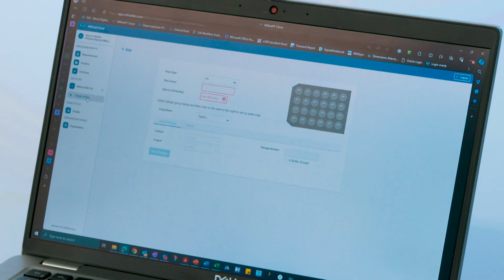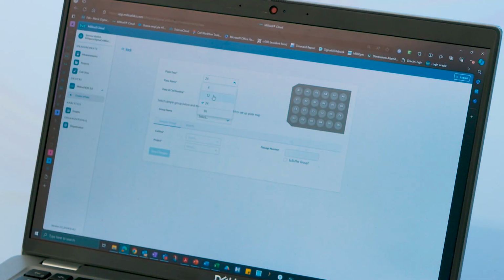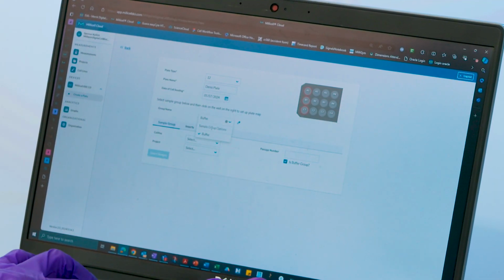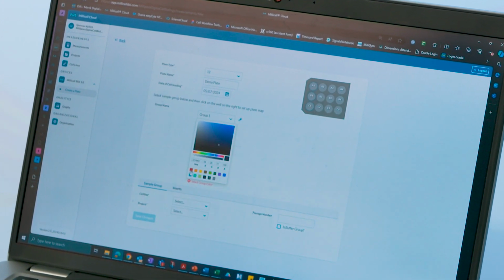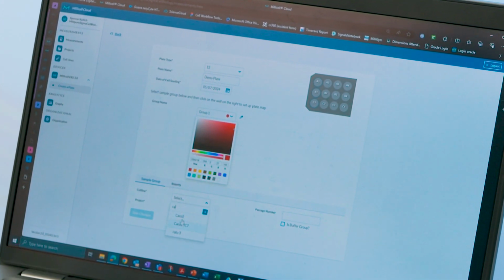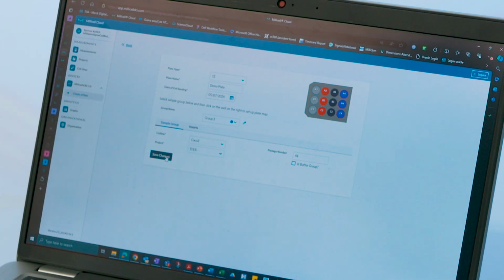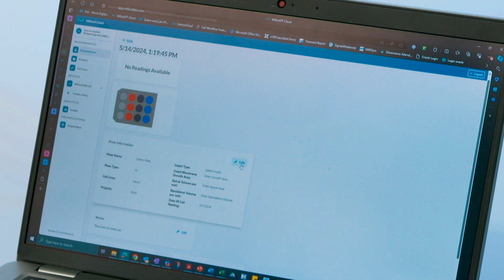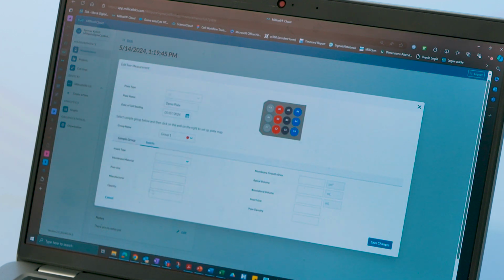Creating a plate on the cloud is easy and automatically downloads to your networked ERS. Fill out plate information and create groups for your wells from the comfort of your desk. The cloud offers additional information fields beyond those available on the device, such as insert information and metrics.